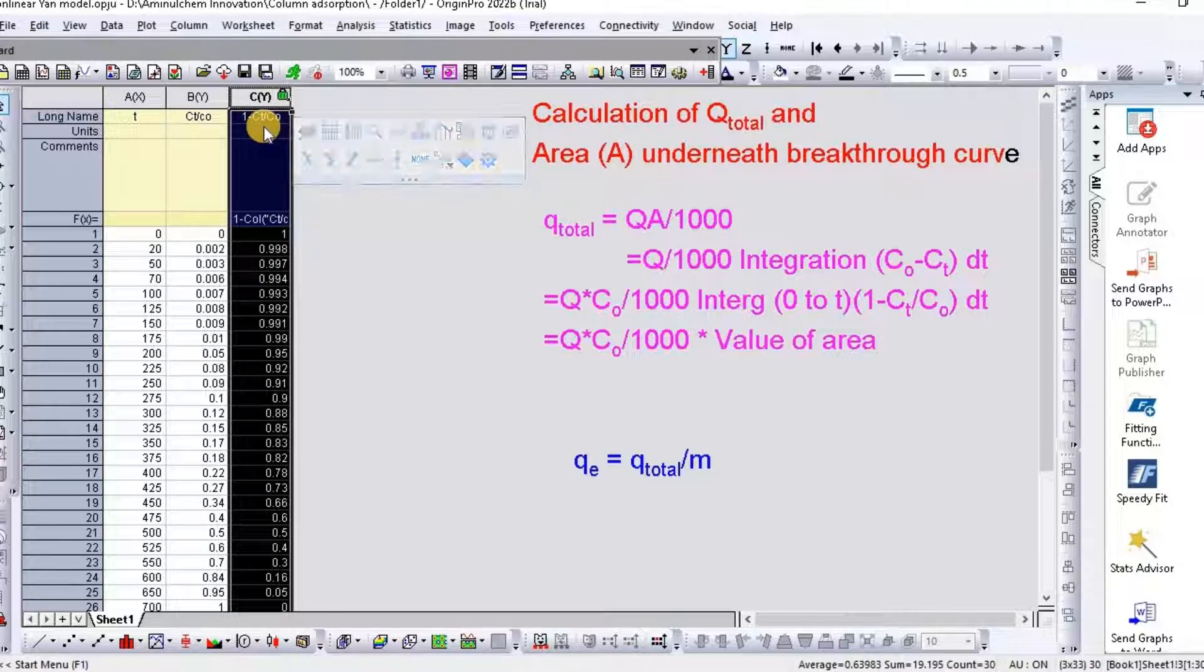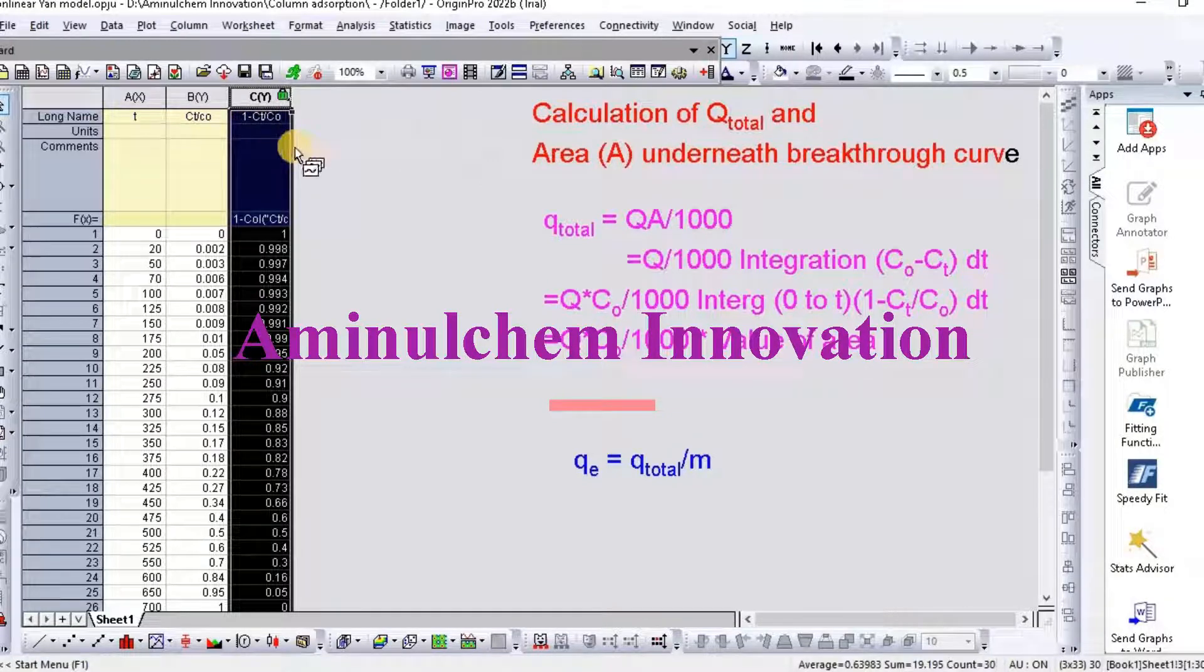Just select and set column value, then 1 minus Ct by C0.